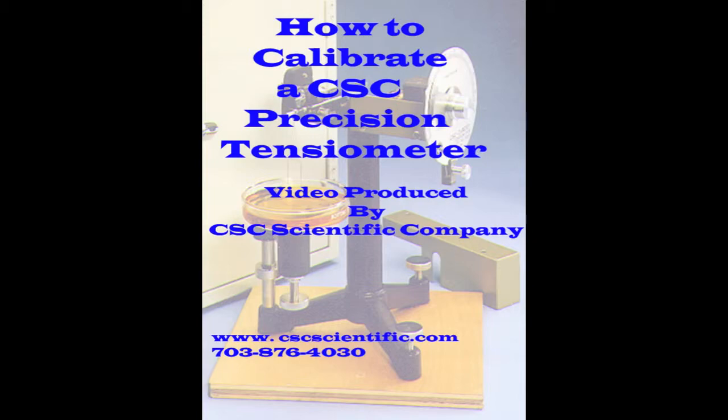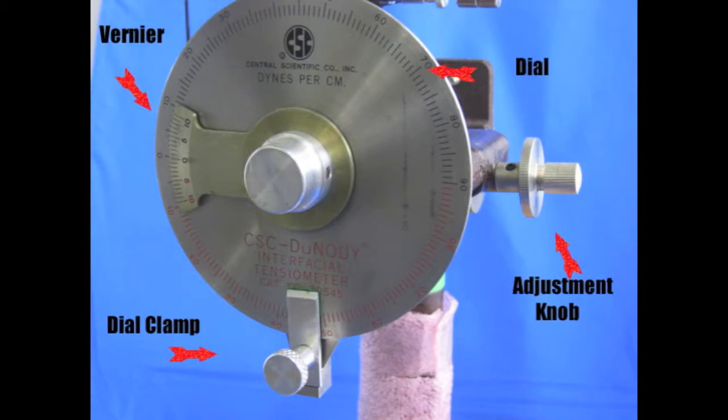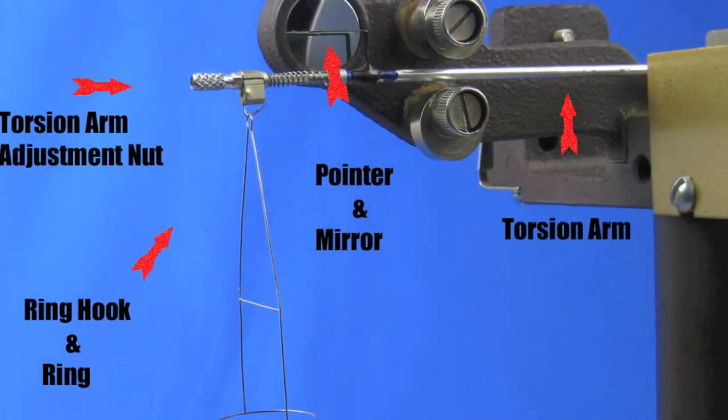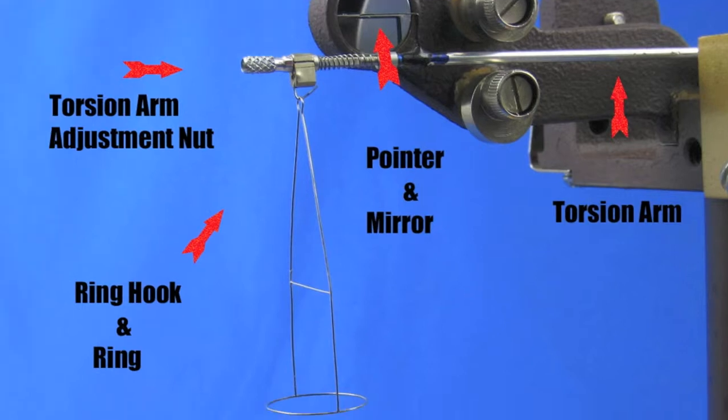Our first task is to identify the key components of the tensiometer. They are, as indicated by the arrows: the dial clamp, the adjustment knob, the vernier, the torsion arm, the mirror line and arm pointer, the ring hook and the ring, and the torsion arm adjustment nut. You start the process by attaching the ring to the ring hook.